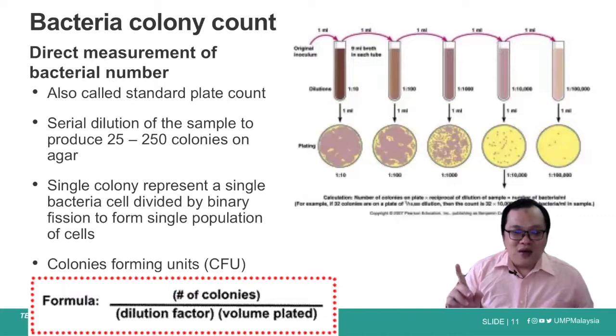The second plate also is too numerous to count, and the third plate also is too numerous to count. And in the last plate, we only have 4 colonies. It's not statistically useful to use that colony number for the calculation of CFU per ml. Usually we term that as too few to count.